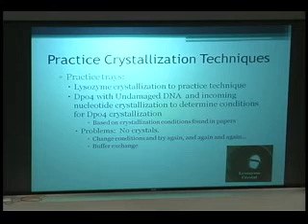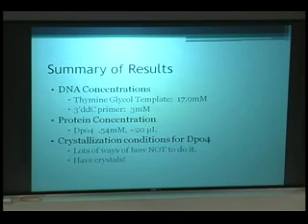Then we also practiced with the Dpo-4 and the undamaged DNA to determine the appropriate conditions for crystallizing Dpo-4 with the modified DNA. We based this on crystallization conditions that we found in different papers, and we had some problems for several weeks. We weren't getting any crystals. We changed conditions. Melissa and I worked on different trays, varying different things, and still weren't getting any crystals. So Dr. Lone suggested we try to exchange the buffer that the protein is dissolved in, and that actually worked.